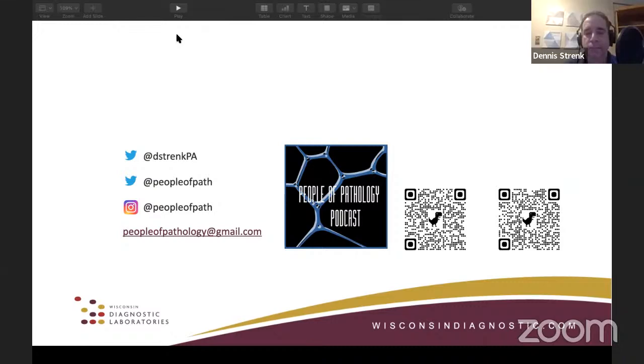Right. Yeah, exactly. And another thing Mr. Strenk has shown, if you have noticed, is the cassette designation, which is so important, right? Sometimes we forget that, but the description of the gross specimen is the last chance to document that specimen, because after even 2-3 months, nobody will be able to look at the specimen, but that description is all that we have. And the designation of the cassettes is so important, as you have shown in that example. Thank you so much for that. And I just want to add something here about lymph node designation in those cassettes. Do you want to add something about it, Mr. Strenk?